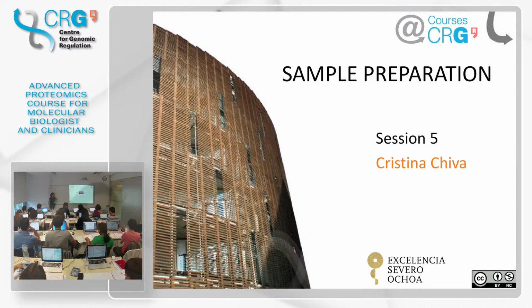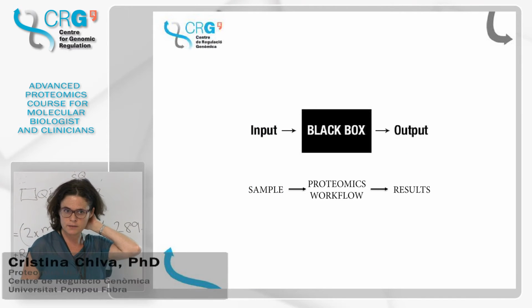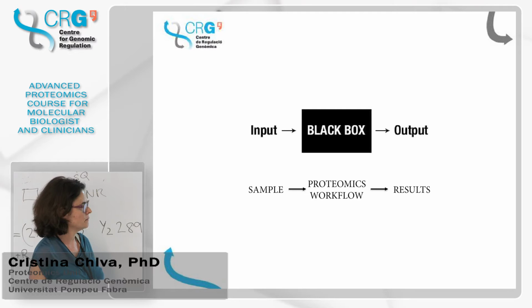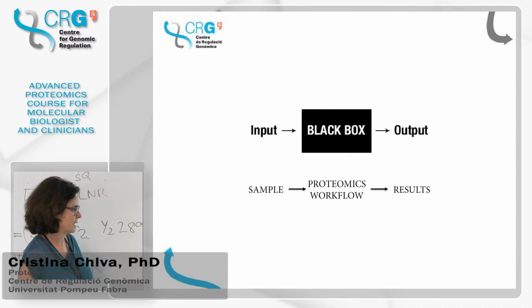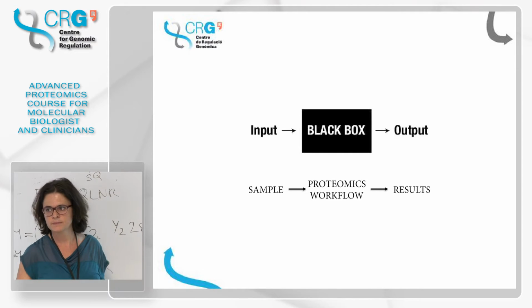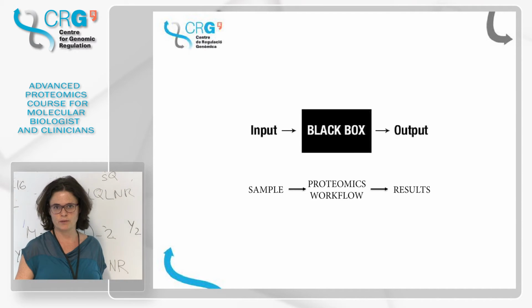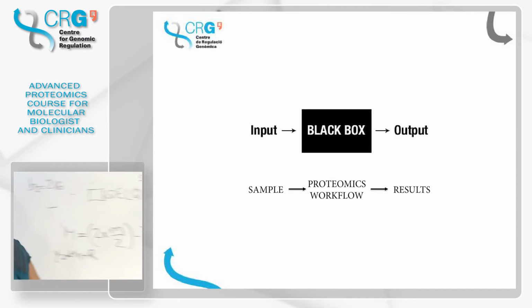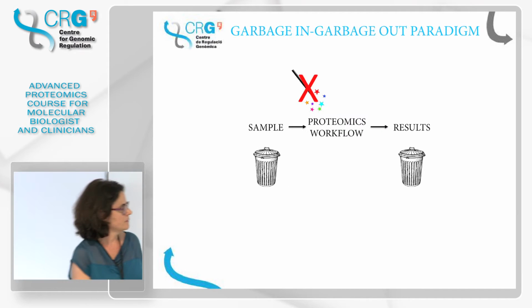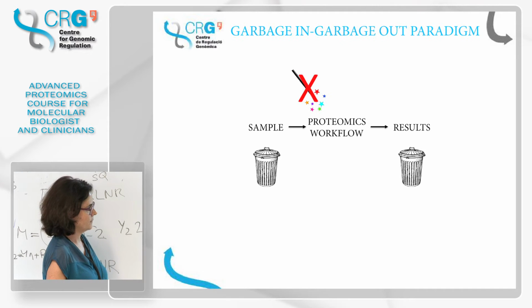Okay, so some people see proteomics as a black box. They put in an input and they get an output, okay? Or, what is the same, they put in a sample and they expect some results. So you are here to learn about this proteomics workflow, which I think at the end of the week you will know a lot. But there is another important point, which is the sample.